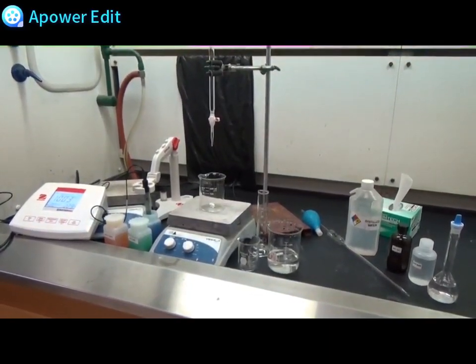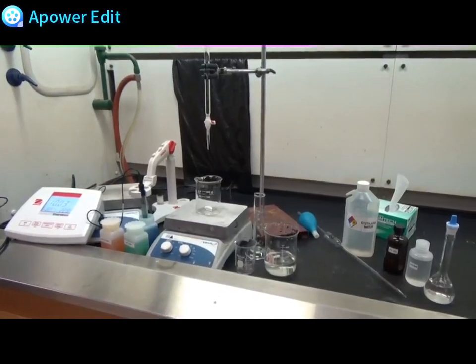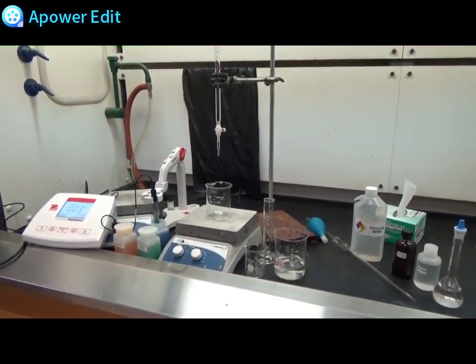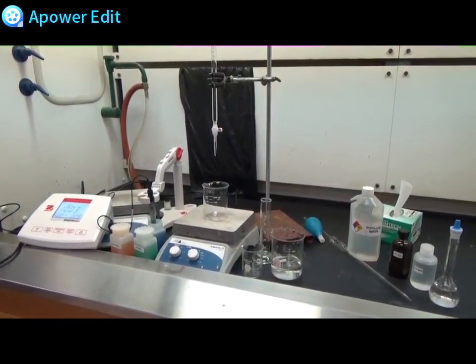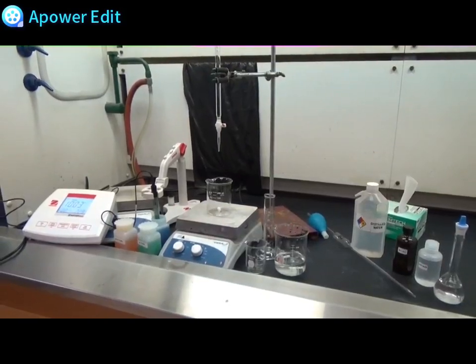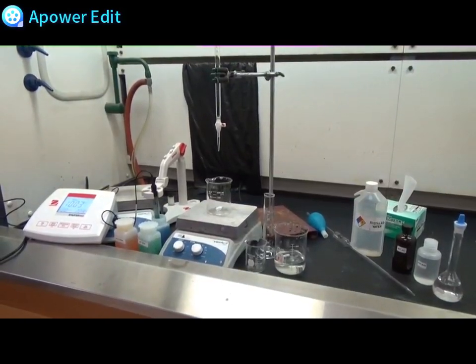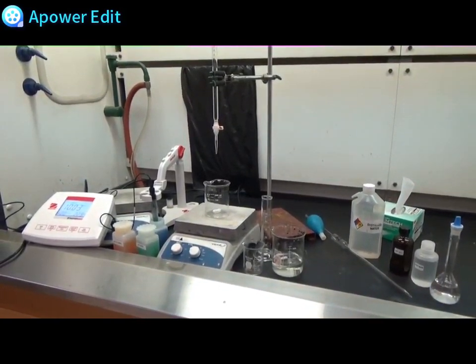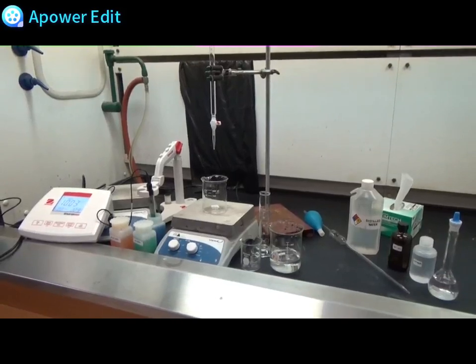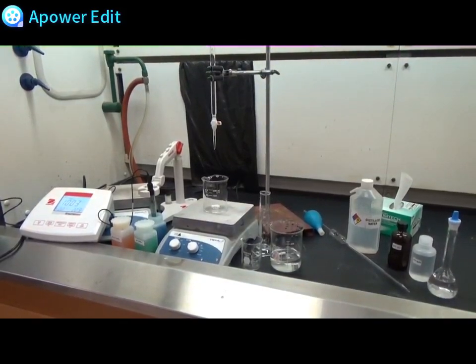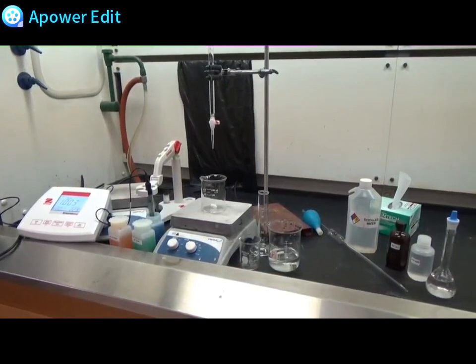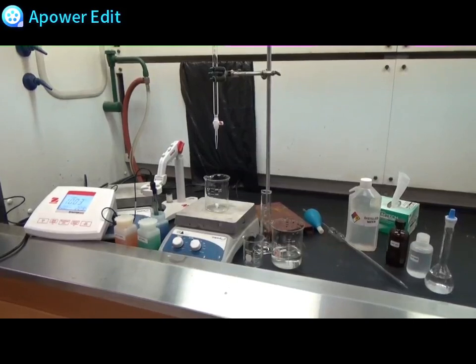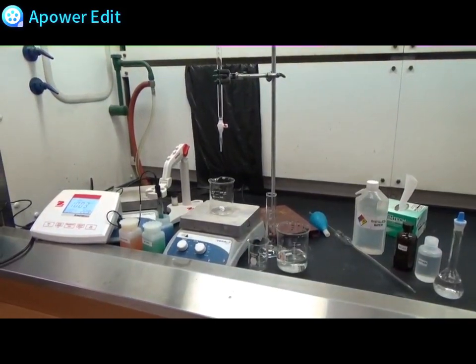Today we'll be titrating 0.5 molar glycine solution. We are not looking for an endpoint today. We will be mapping out the change of pH of the glycine solution as we add base to the solution. We're going to acidify the glycine solution with 6 molar HCl until we reach a very low pH about 1.5, and then we will begin recording points of change of pH as we add base.